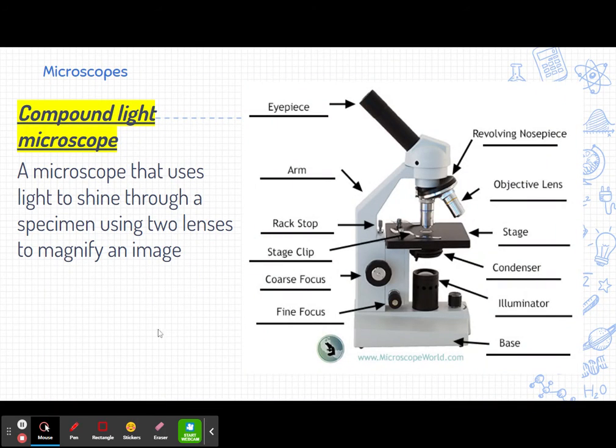So our microscopes. This is a microscope that we're going to deal with. Our microscopes all have illuminators. We don't have microscopes that have a mirror on the end to reflect the light. For the most part, our microscopes have one eyepiece. I don't think we have any with double binocular eyepieces. We'll talk about all the different parts. You don't have to memorize all the parts right now. We're going to deal with that in lab. We're going to look at things underneath the microscope, how things change, the depth of field, the space. It'll make a lot more sense when we do it in class.